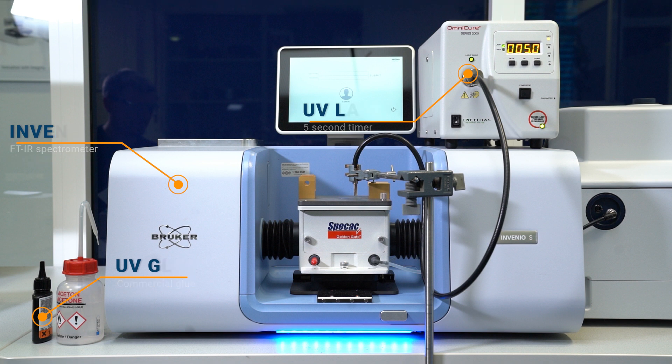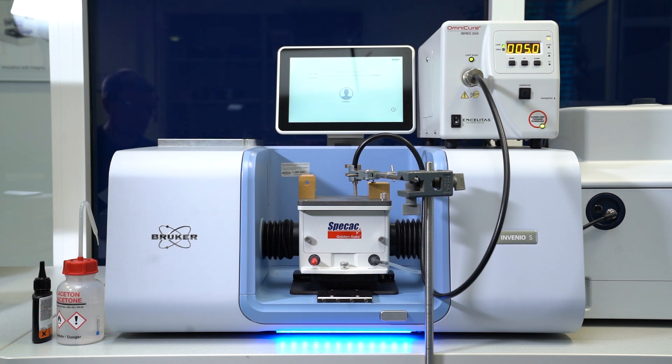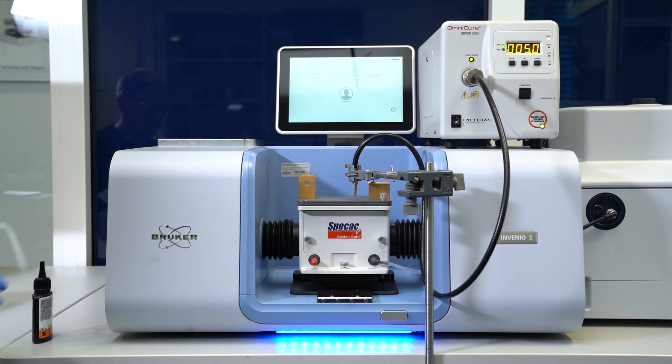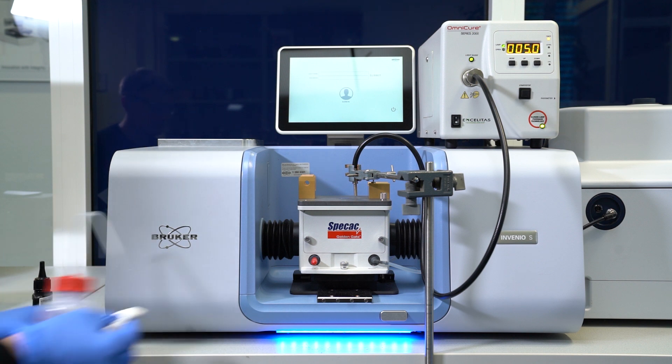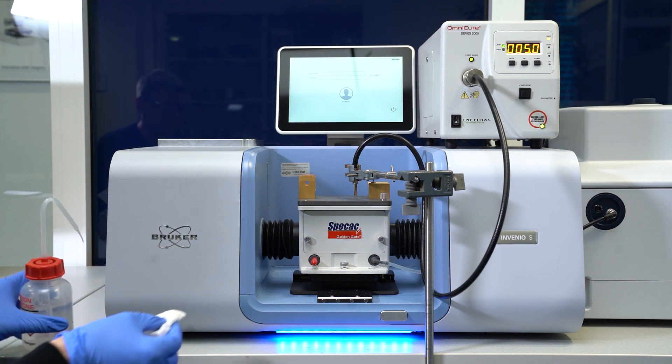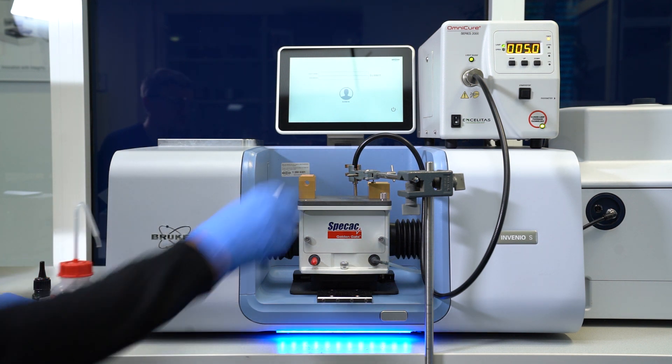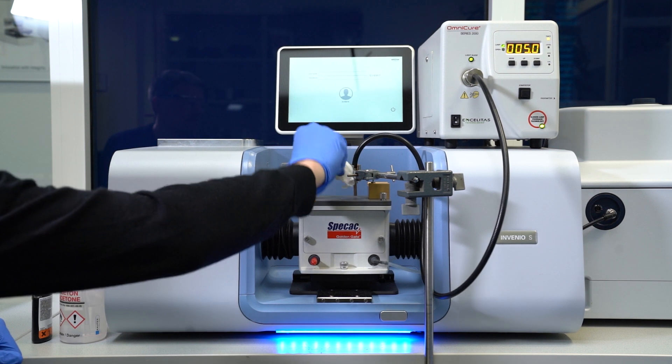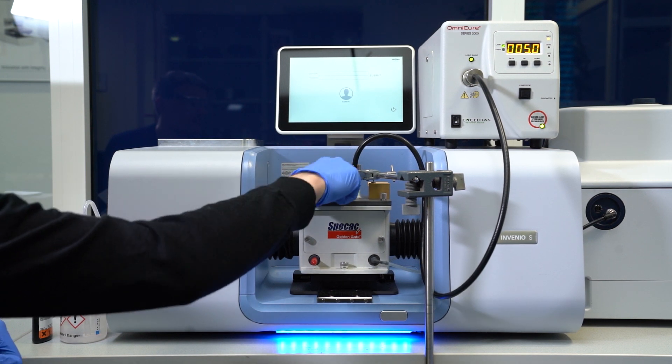Before we begin, we make sure the measurement interface, a very robust diamond ATR crystal, is clean. As diamond is a very inert material, you never have to worry about damaging the accessory.